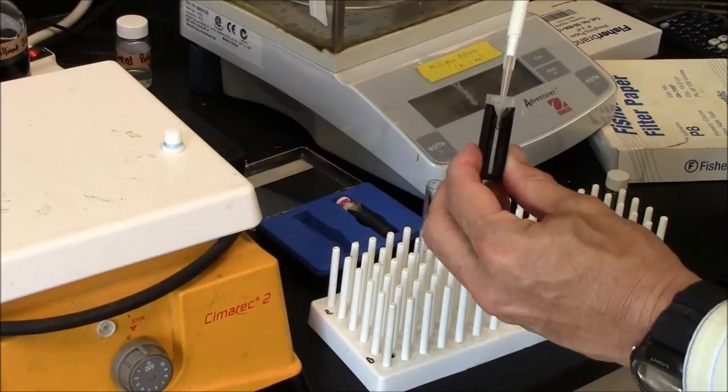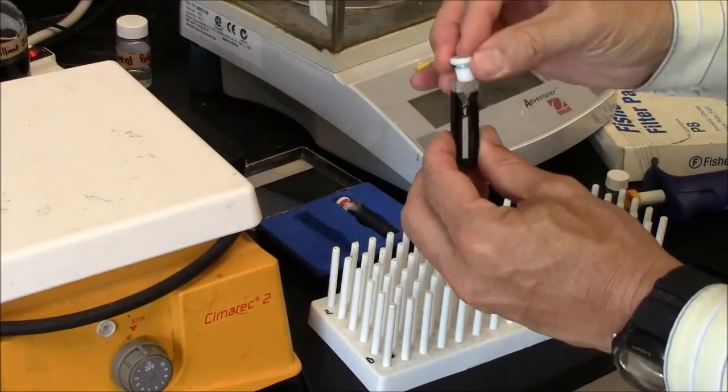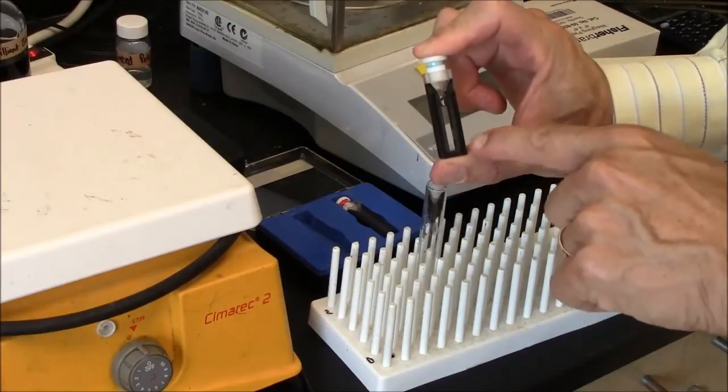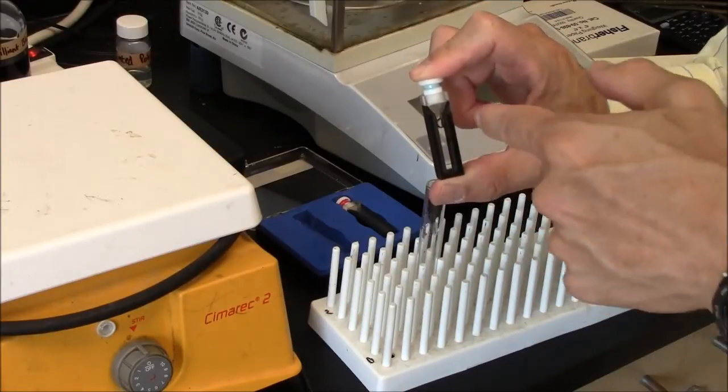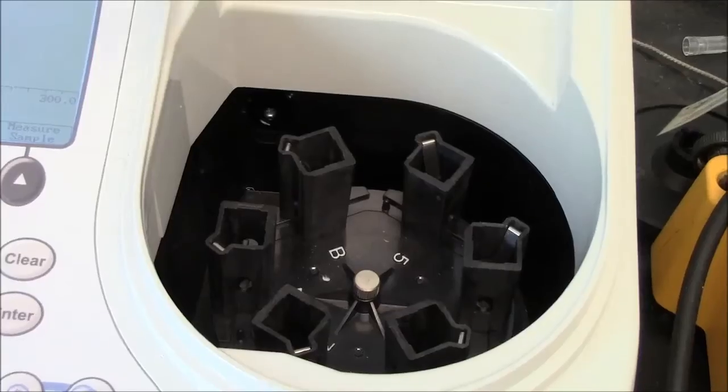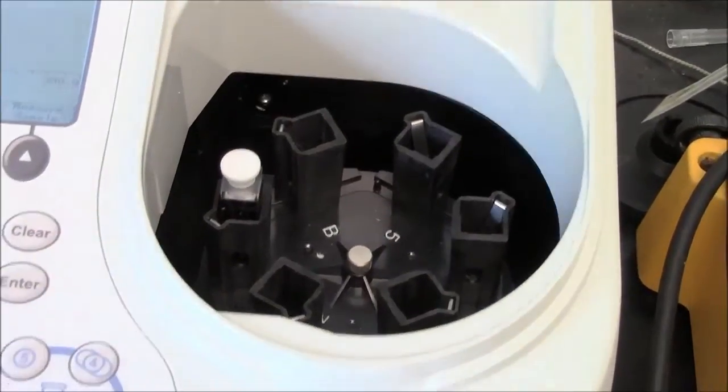I'm pipetting directly into the ethanol. I know my sample has been delivered. And now I need to mix. If I don't mix it, sometimes my molecule ends up on the bottom of the cuvette and it's not measured accurately. So I need to make a homogeneous solution. So I put the cuvette into slot number one. And I close the lid.